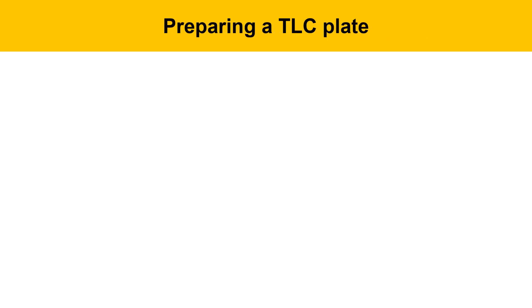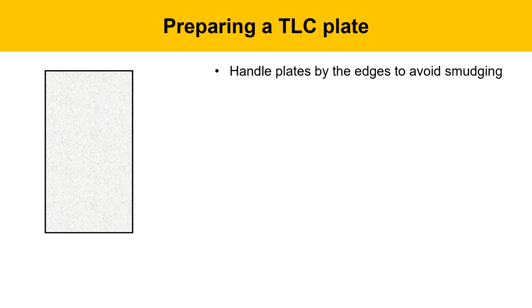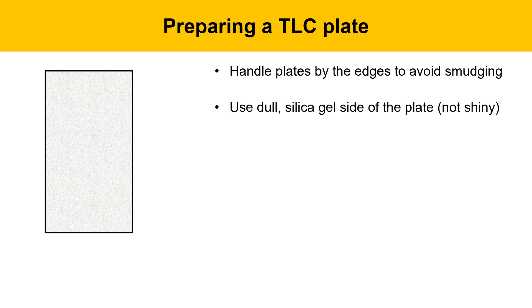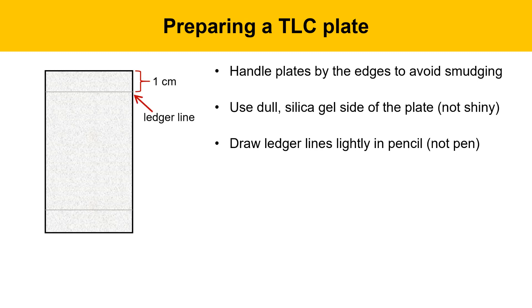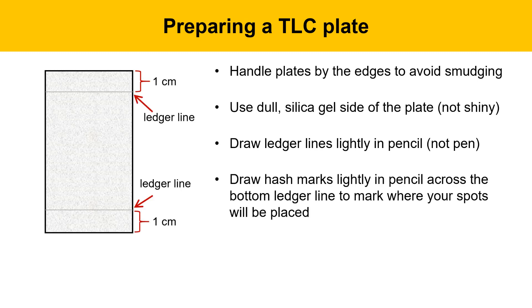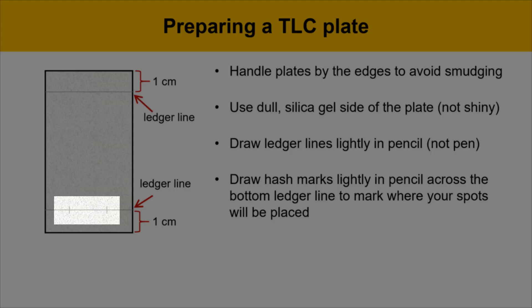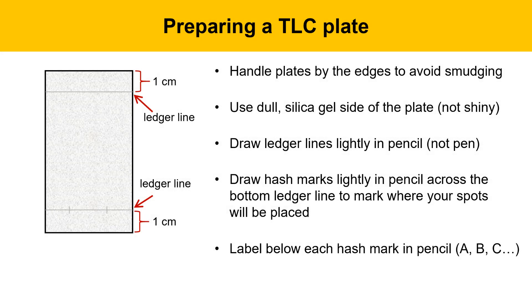To prepare a TLC plate, handle it by the edges to avoid smudging it. We'll be using the dull silica gel coated side — the shiny side is the plastic backing. Draw ledger lines lightly in pencil (not pen, because pen will smear) about one centimeter from the top and one centimeter from the bottom. Then draw hash marks lightly in pencil across the bottom ledger line to mark where your spots will be placed, and label below each hash mark — A, B, C, or another labeling system — to keep track of the spots.